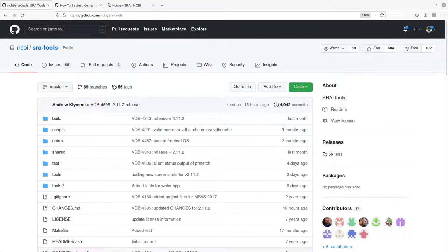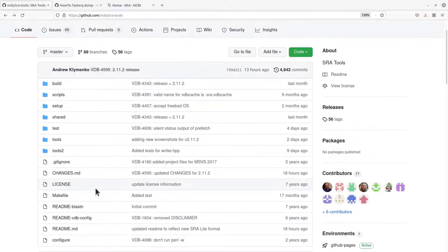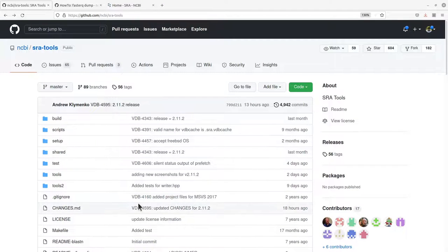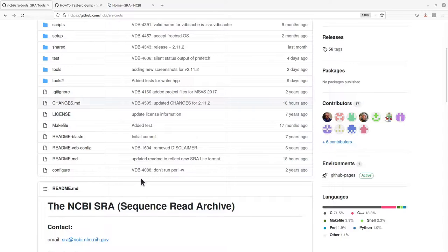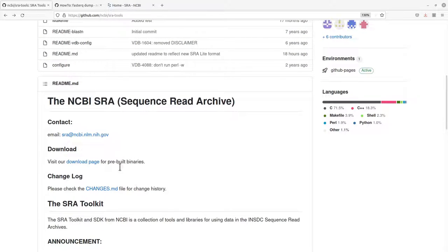There are a number of ways you can install: you can use the binary, you can compile, or you can use Anaconda. For this video I'm going to use the binaries. This particular video is in preparation for the main video on how to download data from the SRA database, so please watch that video as well after installing. Here is the GitHub page for the SRA Toolkit.